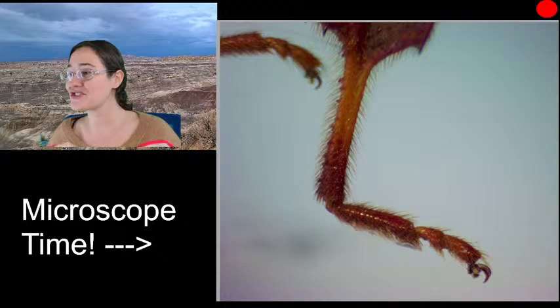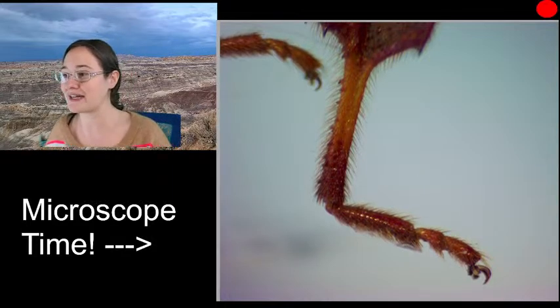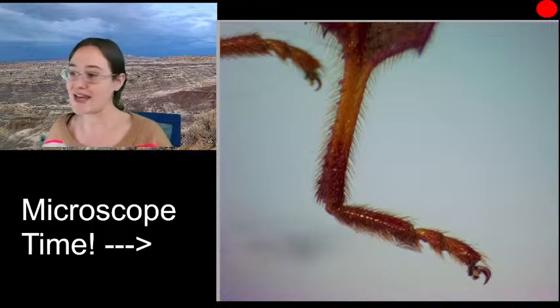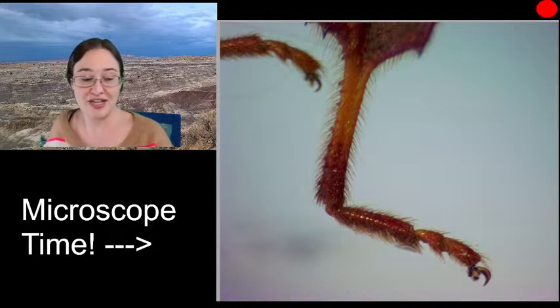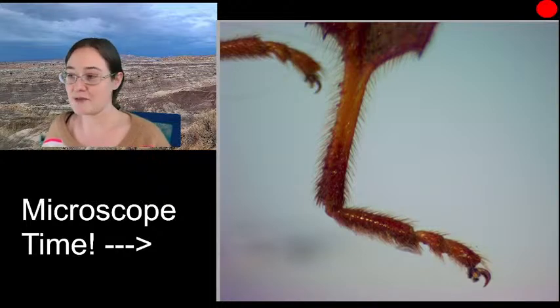What insect are we illustrating today? We are illustrating the western leaf-footed bug. This is a species of coreid. It's a species of leaf-footed bug. And its scientific name is Leptoglossus clypealis.